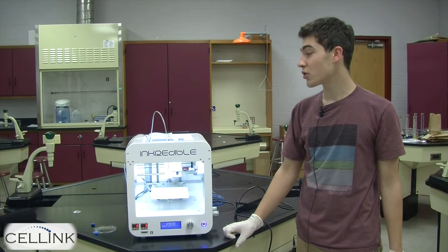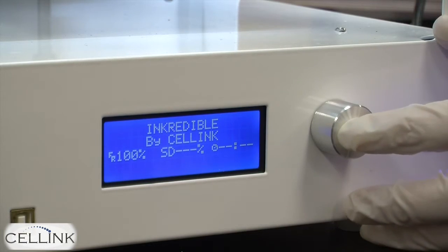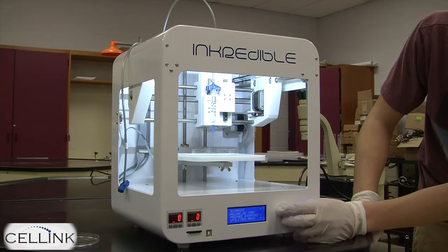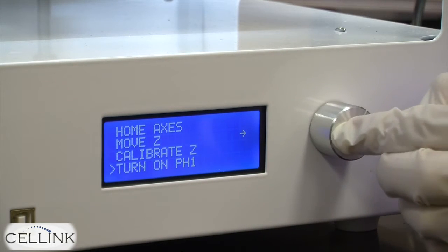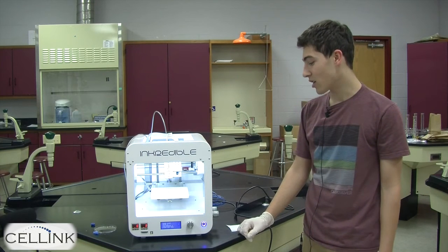Next, make sure that print head one and print head two are on. To do this, press the silver knob once and scroll down to the prepare bioprint menu. Scroll down again until you see turn on print head one. Now print head one is receiving pressure from the air compressor.